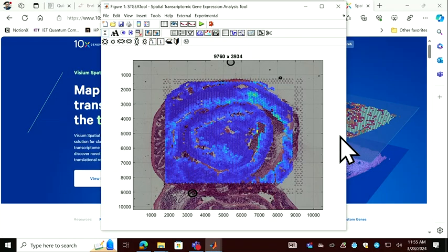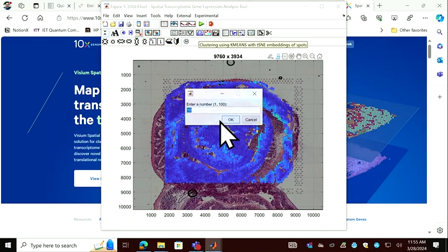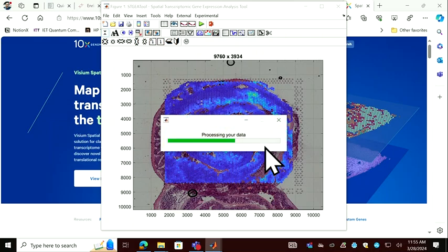So the data analysis will be more important because once you have spent such an amount of resources to get this, you want to extract valuable information out of it. But now I don't know how to do it in reality. Oh, the software can do it. You can do clustering. You can cluster the spots, and it will show you the cluster membership of those spots.